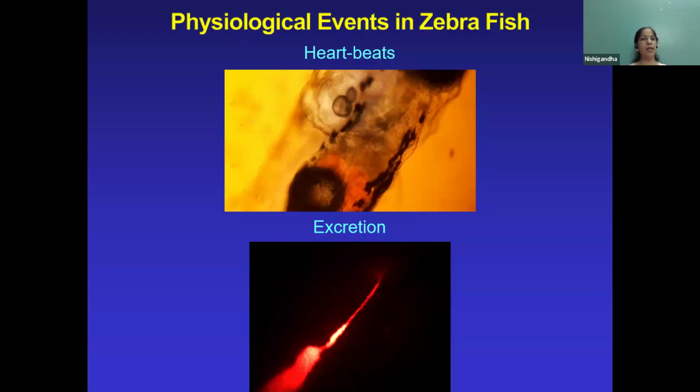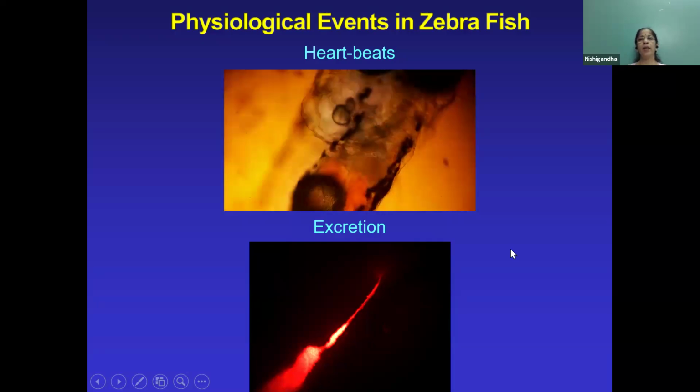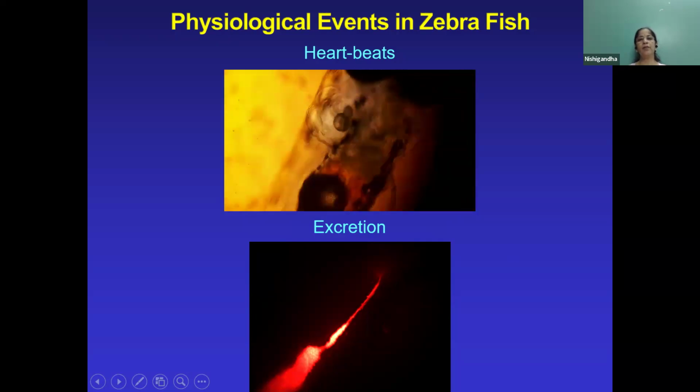Now, zebrafish, which is a very transparent small animal, we can study the whole animal on the microscope. What I'm going to show you is zebrafish heartbeats. I'll play the movie, but I hope you can see the heart here, the upper and lower chamber. Can you see the blood flowing from here, going from the upper chamber and being pumped out to the lower chamber here?